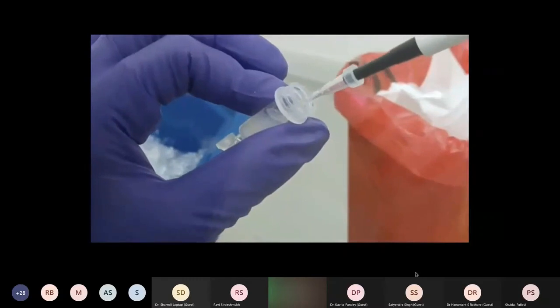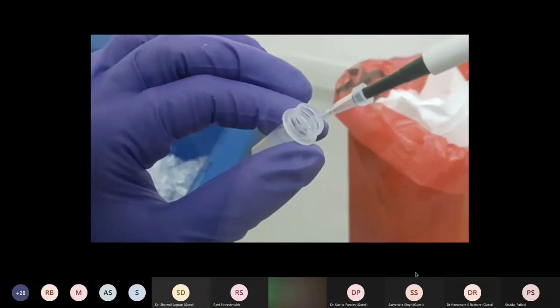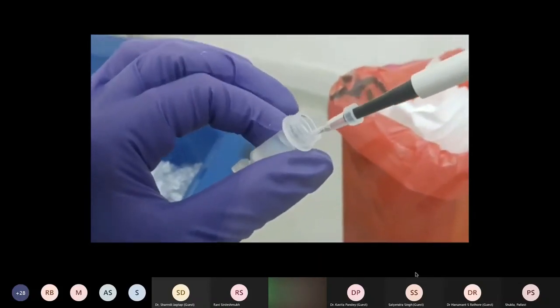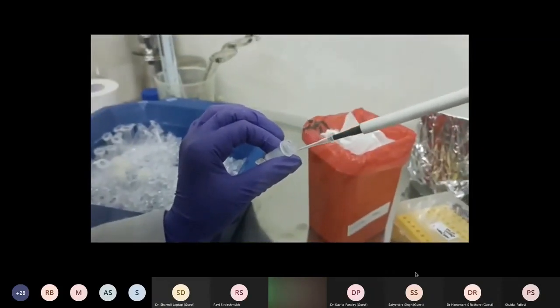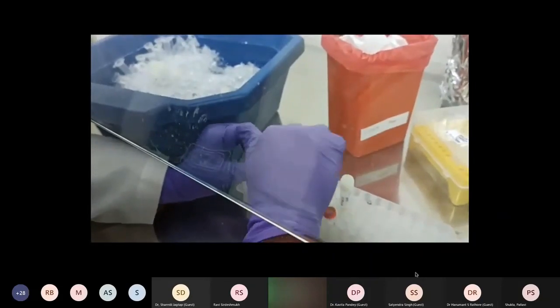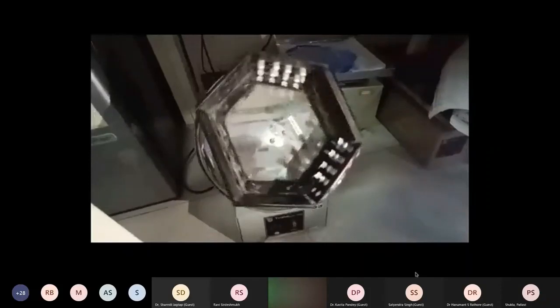And now, into the resin, the beads which carry the antibodies, you are mixing your plasma sample, making sure that you keep it for sufficient incubation time so that the plasma is mixed well with these beads and the slurry. You incubate so that all the abundant proteins like albumin and immunoglobulin can bind to the column which contains the antibodies. Then you do centrifugation to elute out the unbound protein, which is your low abundant proteins, devoid of albumin, IgGs and other abundant proteins from plasma.